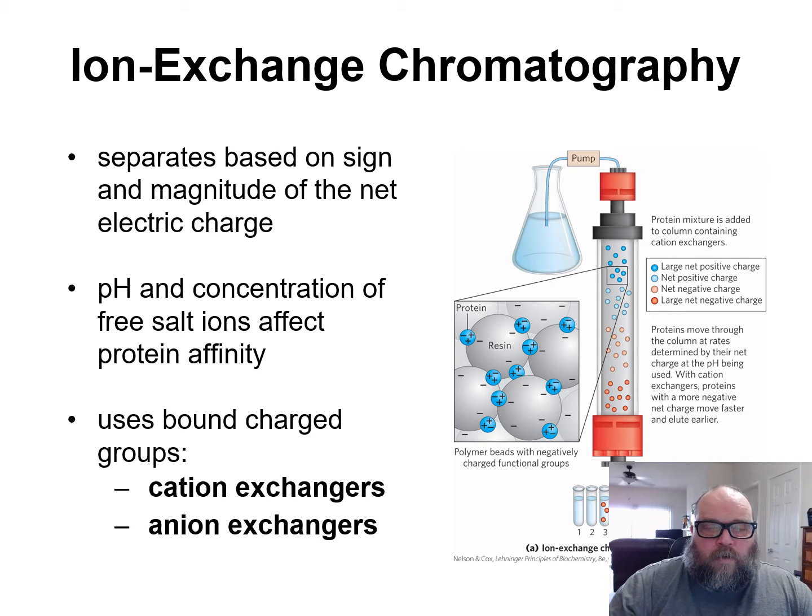Here, the column one, a lot of times that's going to be size. Here, ion exchange, literally, you've got to remember proteins at different pHs are going to have overall charges that are different. So, a resin, microbeads, that's overall negative charge, then proteins that have an overall positive charge will adhere. Everything else flows through.